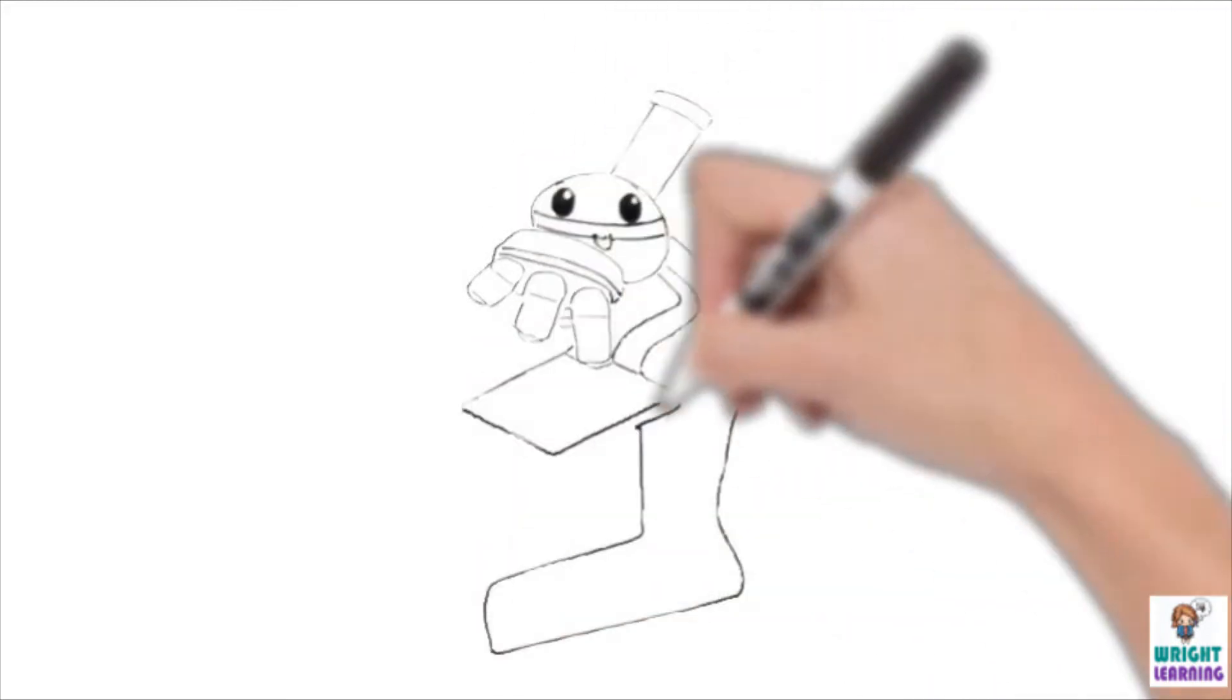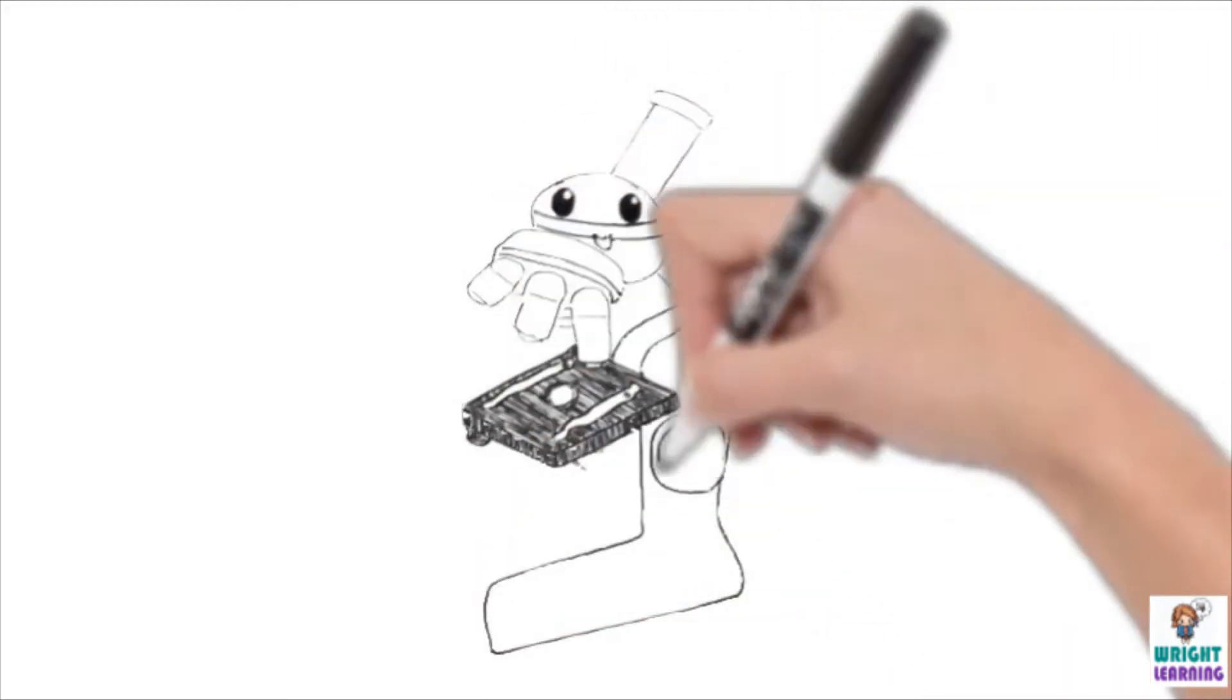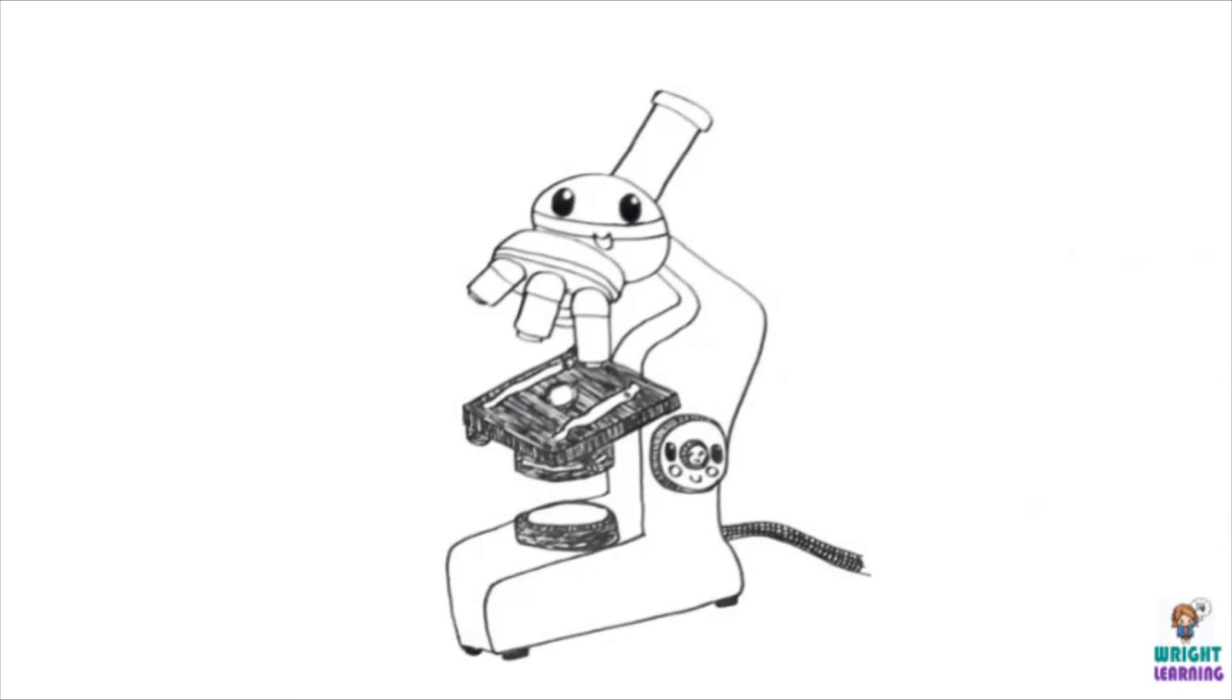Firstly, it's important to know the different parts of your light microscope. Your light microscope might not be as cute as this one, but the parts are essentially the same.